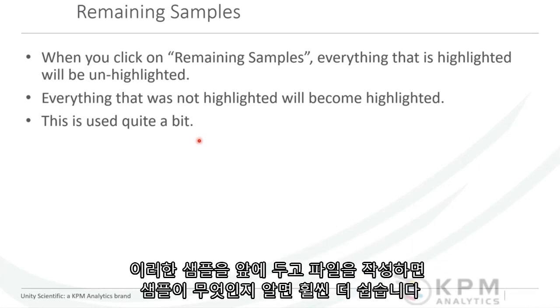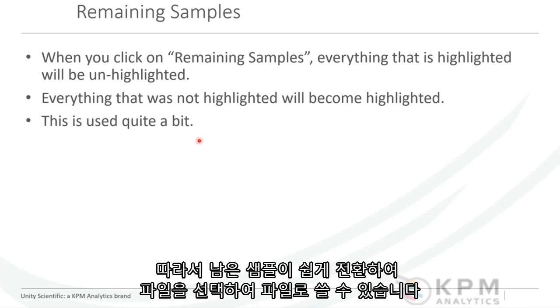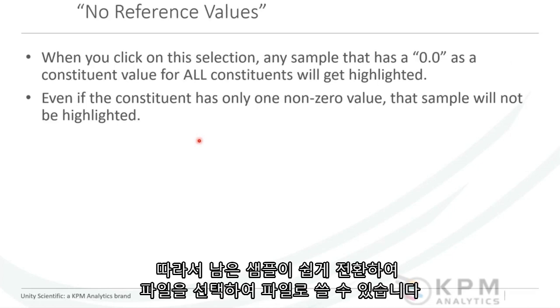And it's much easier while you've got these samples in front of you and you know what they are if you write them out to a file. So this is where remaining samples really comes into use. Remember that you can easily toggle, select your remaining samples and write it to a file.